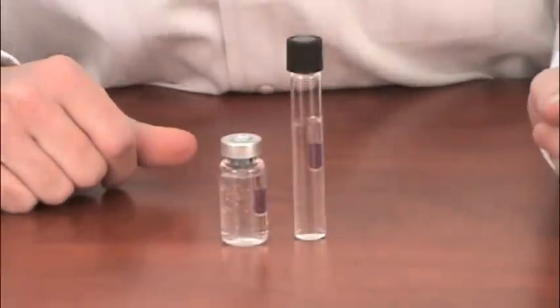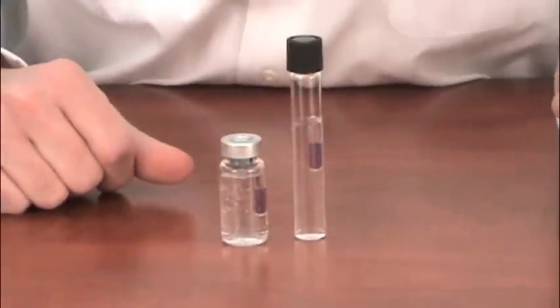Now with our biological indicator seated into the product, we're ready to move to sterilization. You wouldn't want to use a dry preparation biological indicator when sterilizing liquids. By dry prep biological indicator, I'm referring to conventional spore strips or self-contained biological indicators like the Pro-Test or Easy Test.